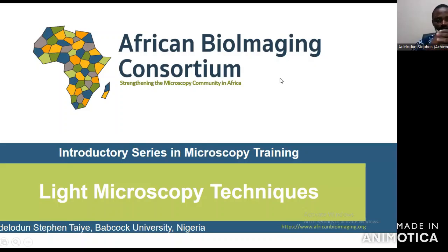the light microscopy. This particular lecture is going to afford us the opportunity to understand the principles and the mechanisms by which the light microscope works. Then it's also going to introduce us to how light interacts with matter so that we have better results in our imaging at the end of the day.